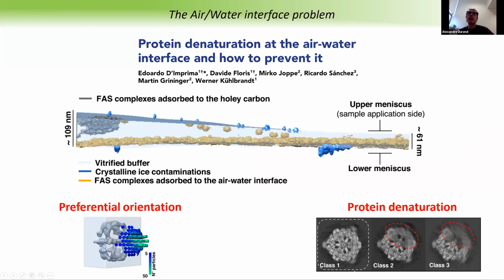These problems have been well described and understood and are linked to the protein denaturation at the air-water interface. There are many papers describing it now. And so just to make a long story short, you all know that these samples have a tendency to accumulate at the air-water interface when you freeze the grids with the VitroBot, and many sample preparation methods actually.